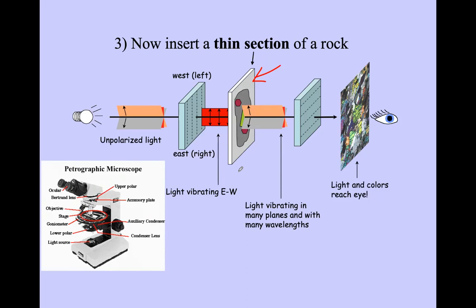So this isotropic and anisotropic behavior causes us to pass some light through the second polarizer. That means this behavior is a feature that helps to reorient the light when the plane polarized light is coming through the sample, right? So some minerals are able to reorient the light. Reorient means the vibration direction will be changed.